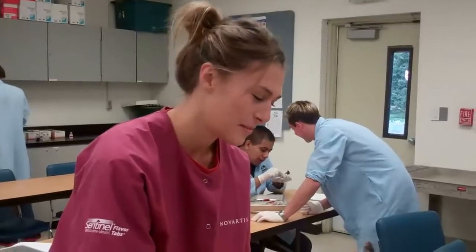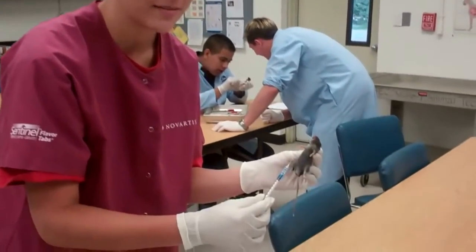Hi, my name is Josie. I'm in vet tech class. Today we are going to give the IP injection to a mouse, and we are going to insert the needle into the body cavity, abdominal cavity region.